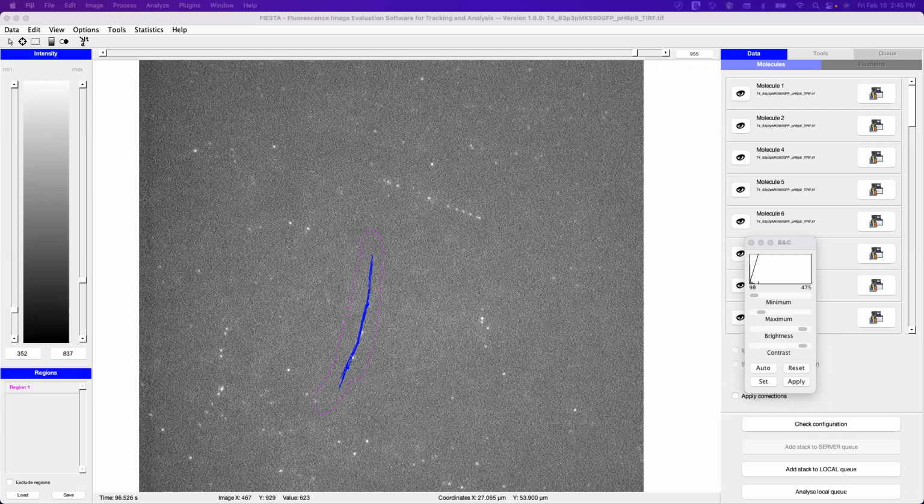They didn't correct the movie, they just correct the data. So if there's a drift, you see maybe like this, but after correction, the data will be like this. You see the difference: one is the corrected movie, the other is corrected data.